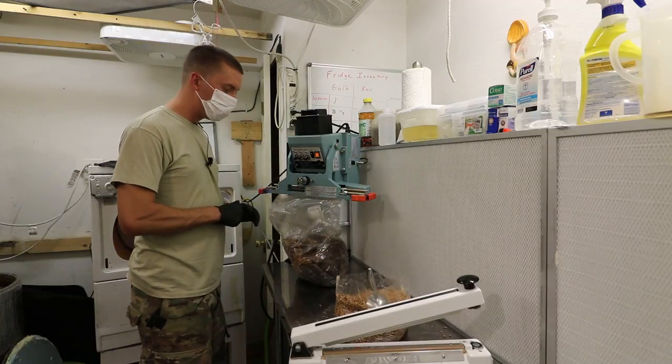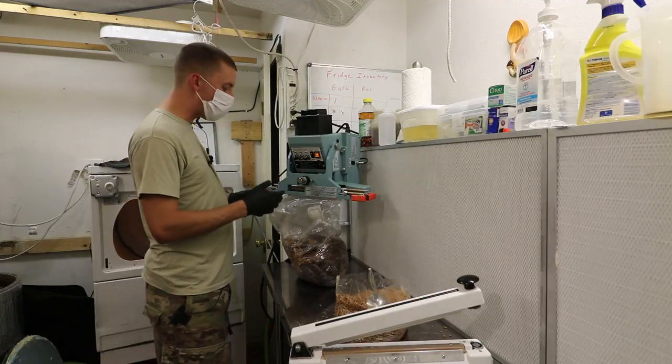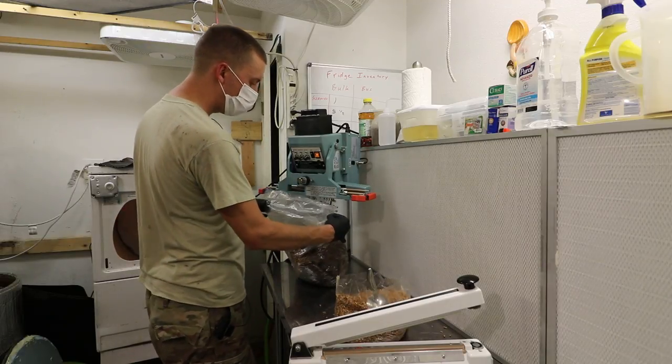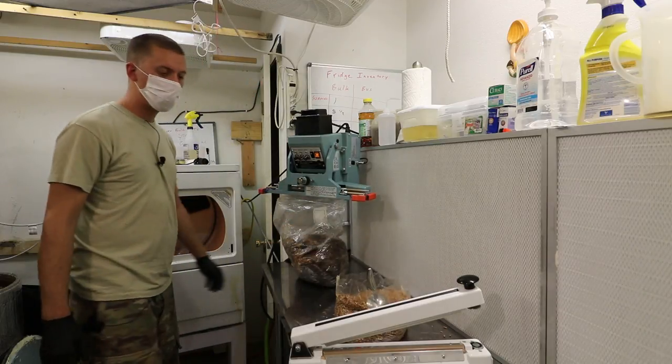I just got a new sealer — this is my 10-millimeter double-jaw automatic one. One of the main advantages over the magnetic-hold ones is you can operate it two-handed, so you can line up the bag exactly how you want it and then boom, seal it.